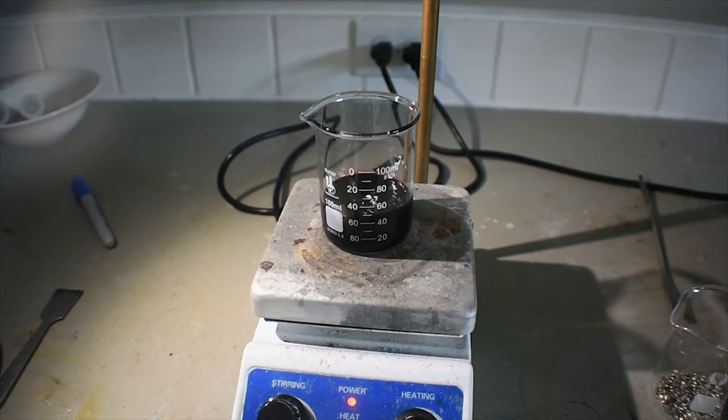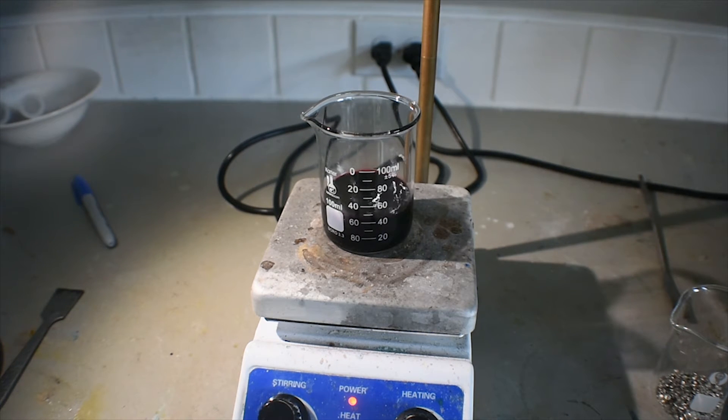A fair portion of the iodine has dissolved, so I'm going to turn on the microwave, inside which I have the water for the water bath. I'm just going to use a Pyrex baking dish for my water bath.